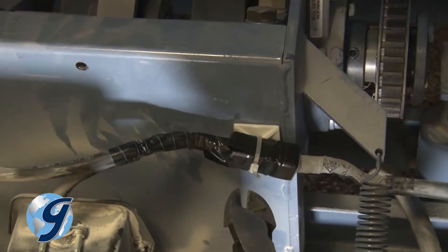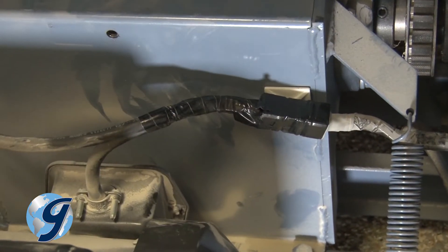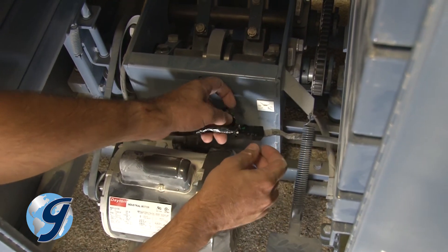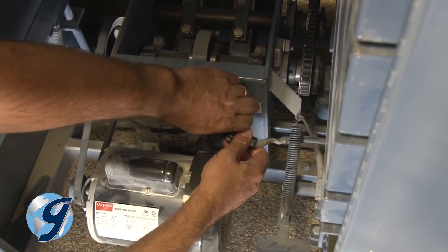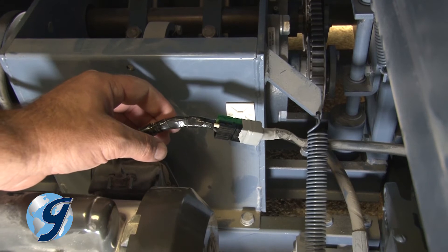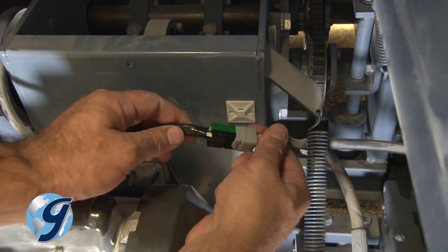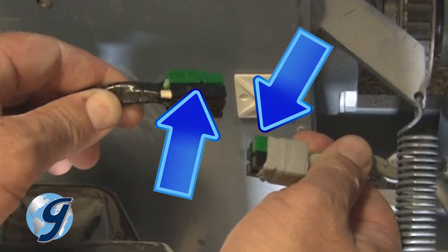Snip the wire tie holding the connection to the unit. Remove the electrical tape around the connection. The electrical tape protects the connection from excess exposure to materials being tested. Once the tape is removed, the connection plug is visible. Unplug the timer from the unit. Please note that the green sections plug into each other.